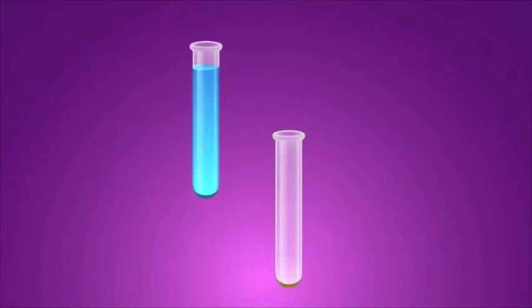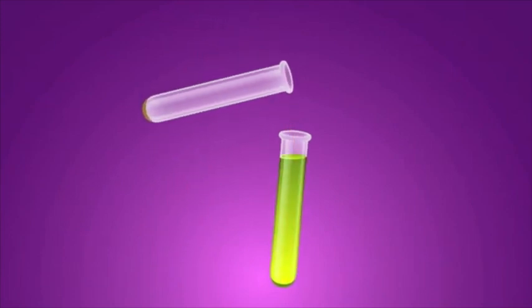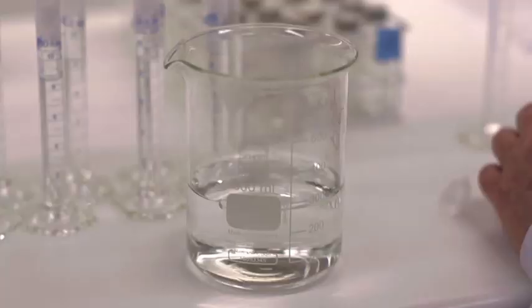Samples were prepared by placing 10 ml of each solution in a regular test tube. Samples were not further purified in the duration of the experiment. Samples to be tested are ethylene glycol, ethanol, and sodium chloride.